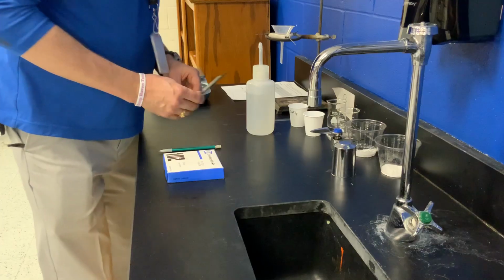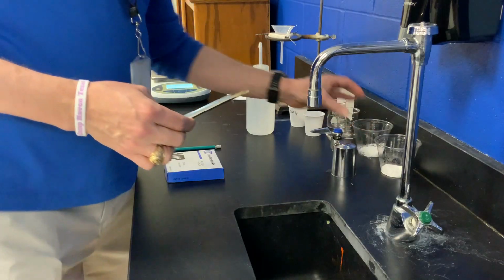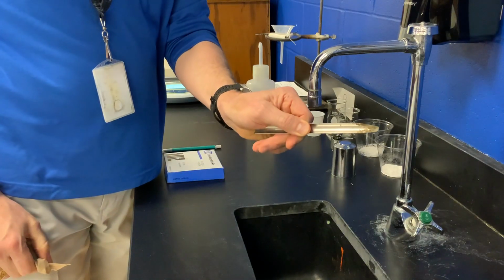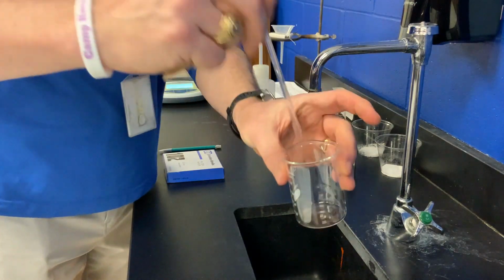You will have a scoopula for use in getting the solids out of the cup. Remember, every time you touch the solid with the scoopula, you need to wipe it off, not rinse it off. You'll also have a stirring rod for making your solutions.